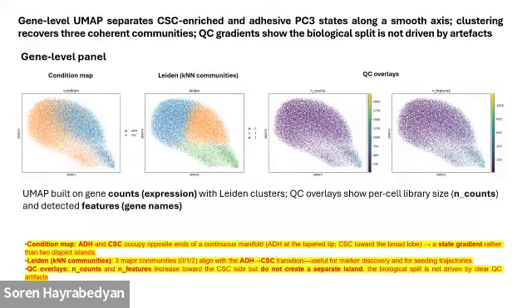98% of the mRNAs detected actually map to full-length RNAs, which means that the barcoding technology is very good because it can capture the whole transcriptome efficiently. So these are gene-level UMAPs.